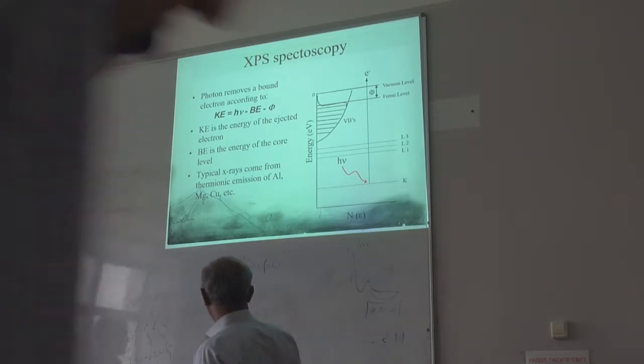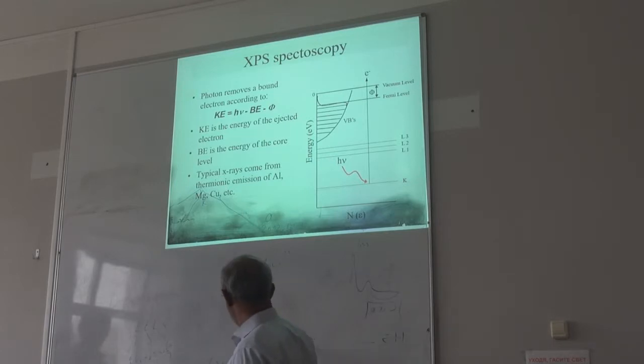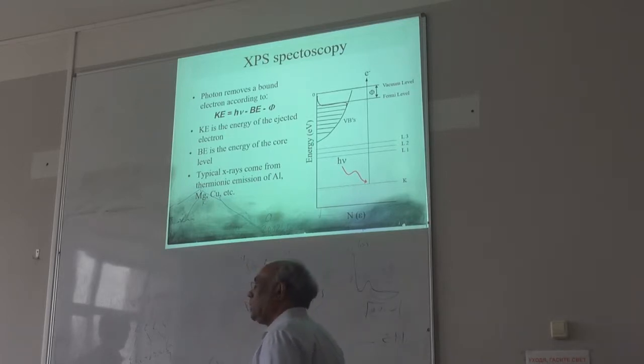So when we actually yields also has some surface properties that I'll talk about later. Now talking about the surface. To do this one we use X-ray to shine on the sample. When you shine on the sample, then again you are going to knock out some core electrons, right? So in XPS, we are directly looking at the energy of this outcoming electron.